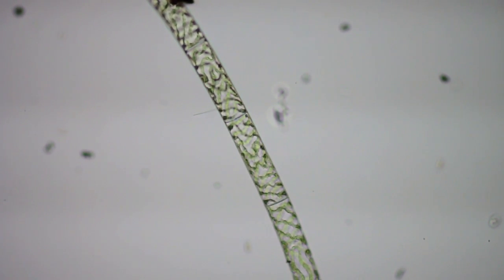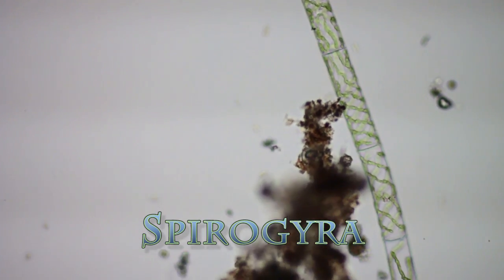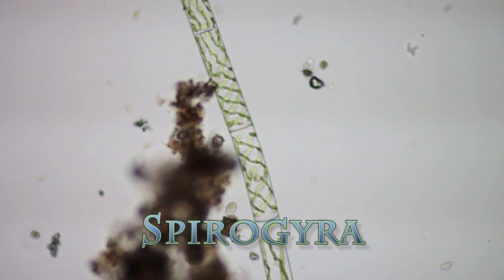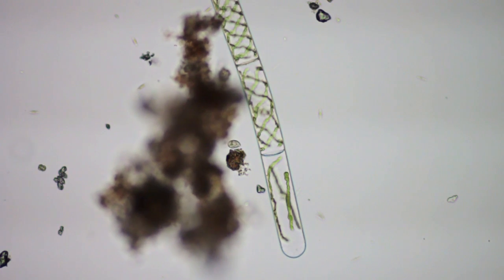This is a spirogyra - in a year of this hobby, it's the first one I've found intact. I'm using a Nikon fluorophot microscope here, and this is one of my low power objectives, a 10x plan achromat. That gives about 100 power when it gets to the sensor. I'm using a Canon T1i to record the video.